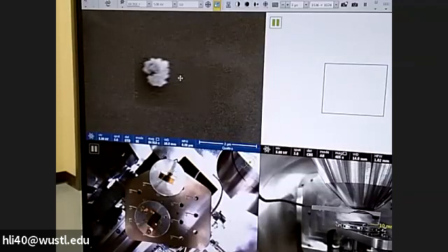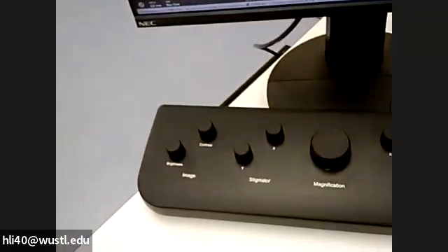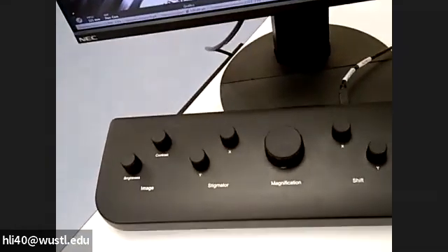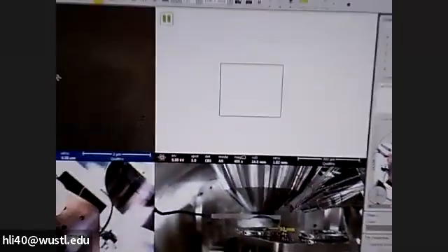to the place which is no elongation. The image may not be clear, but no elongation. So this is the place you should stay. This is the focus place. The next thing is to adjust stigmatism. We have two stigmator buttons, which are on this controller box. So we stigmate them, X and Y. We're going to adjust X and Y to make the image sharp.